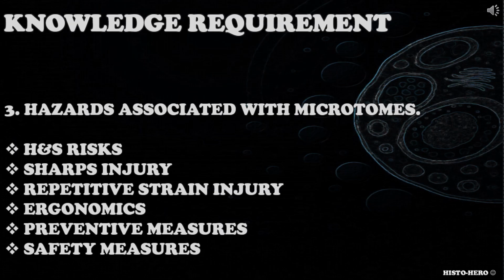When addressing this knowledge requirement, candidates should consider health and safety risks like sharps injury or repetitive strain injury, health and safety risks associated with solutions that can be used during microtomy for difficult blocks, ergonomic setup, preventive measures like use of blade guard, brake, careful approach, safety measures like COSHH, risk assessment and training and so on.